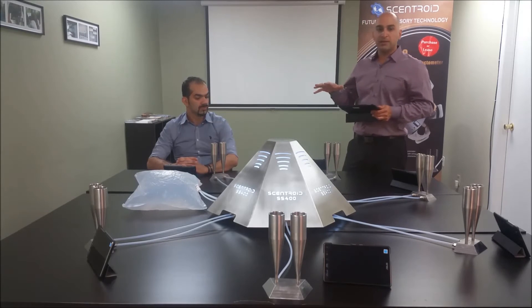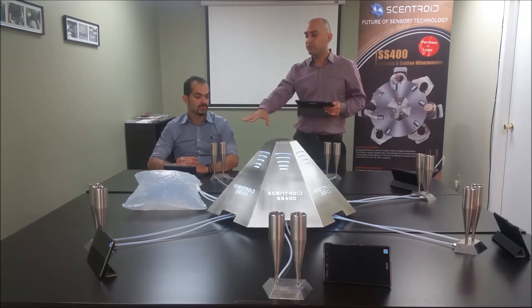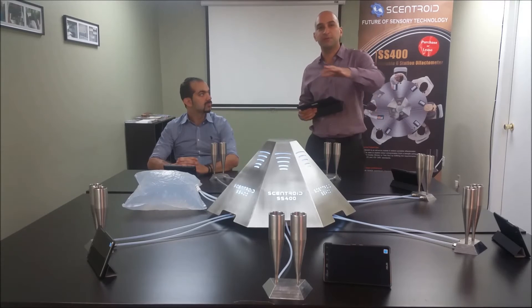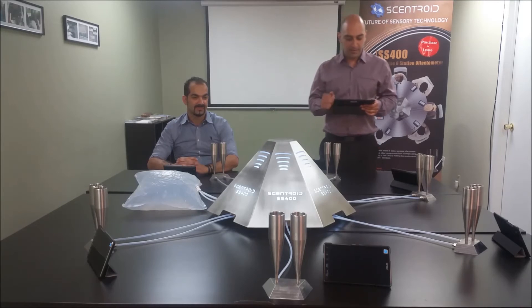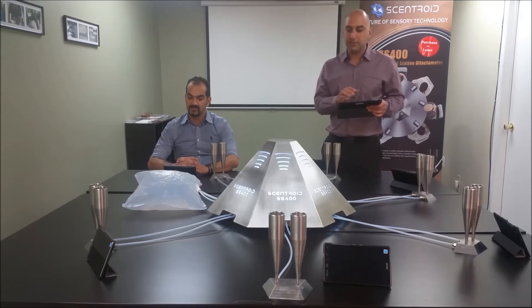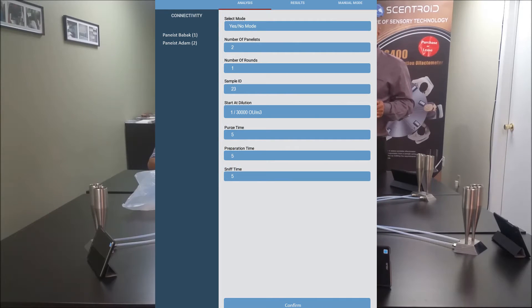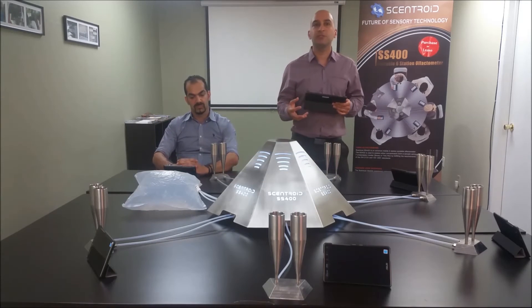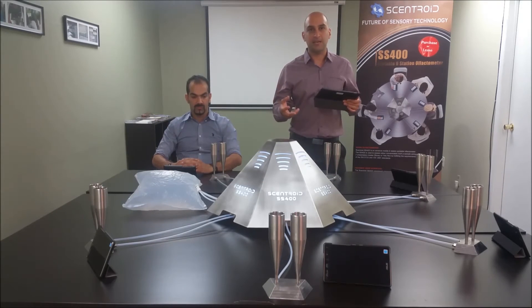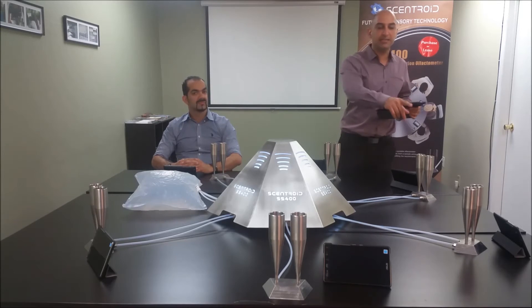So let's begin. I can select how many panelists I need. I'm going to do two panelists — Babak is going to be one of them. I'll answer for the second panelist just to get the test going. I'm going to select yes-no mode, number of panelists two, one round, give it a sample ID, and we're going to start from the maximum dilution. The first thing the instrument is doing is going through an auto-cleaning cycle — you may hear our house compressor in the background. It's cleaning each port separately.